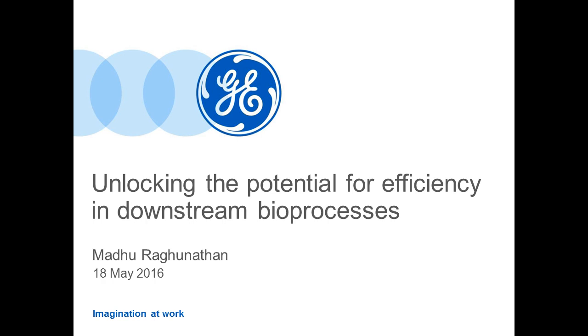So you have to keep all of these into account and then take a decision. I don't think I have a magic answer that says, here is the scale where continuous processing becomes more cost effective. But you've got to think about all of these things and then say, what type of processing makes more sense for me? But from a continuous chromatography perspective, like we talked about, the earlier scales are definitely where you see more benefits as opposed to going up in scale and ending up in large commercial scale manufacturing.